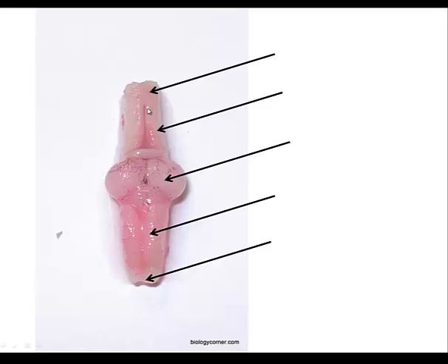Just posterior to the olfactory lobe are two elongated bodies — this is the cerebrum. The cerebrum is the voluntary, thinking portion of the brain, and it's the part that helps the frog respond to its environment.